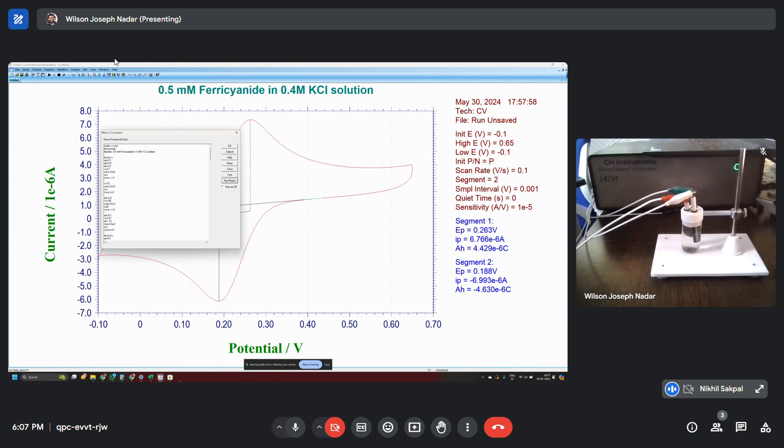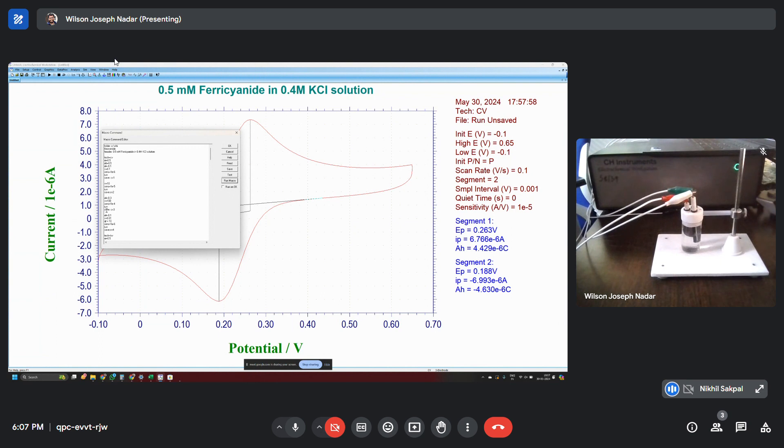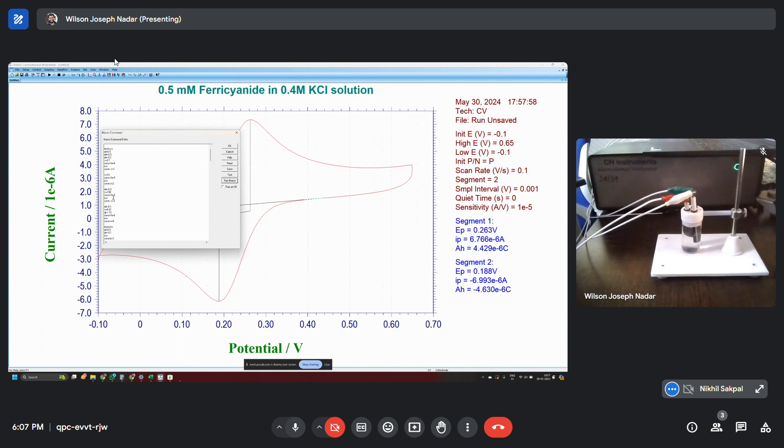And then run and save CV3. Now if you this save colon CV3 is just going to save the binary file. In case you are willing to save the text file as well, then instead of save you should be using TSave. TSave means text save. So there are many more commands that are explained more in the macro command scripting section under the user manual. So you can just go through.